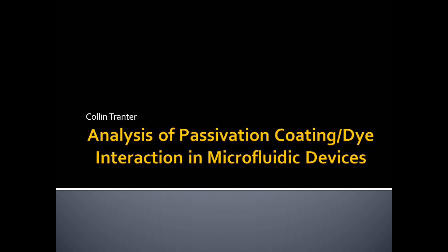Today I'm going to talk about analysis of passivation coatings and dye interactions in microfluidic devices. I'll talk a little bit about the coatings we use in our glass-based devices and about the quantification of these coatings with regard to fluorescent assays.